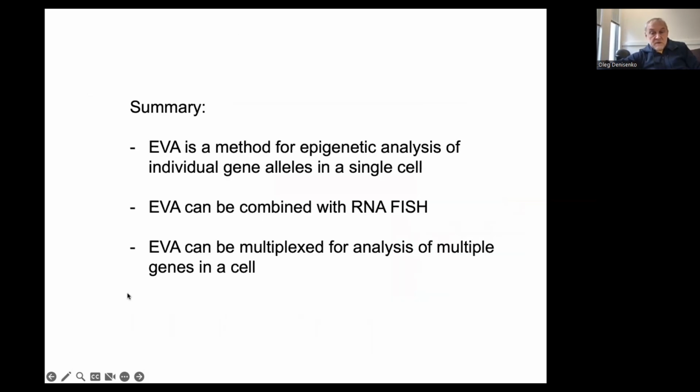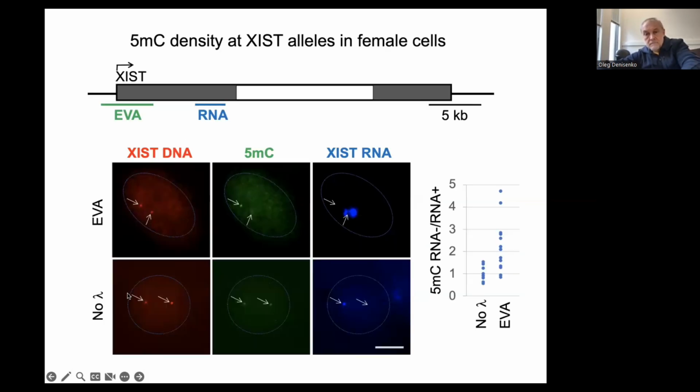In the control experiment, we used no lambda exonuclease treatment, and both alleles have intense green signal.